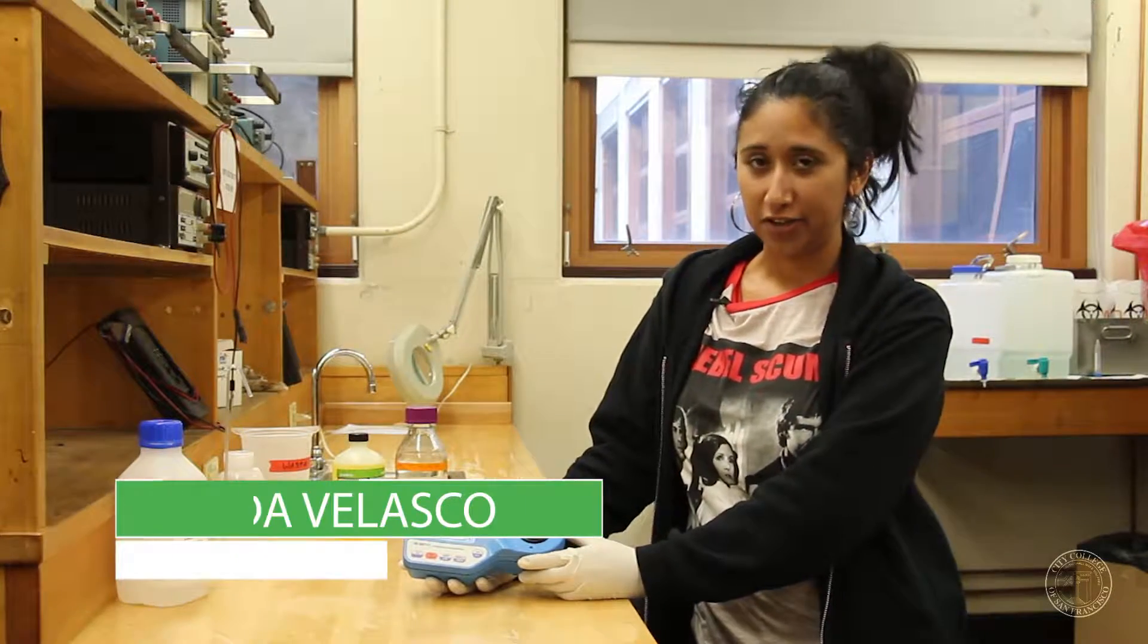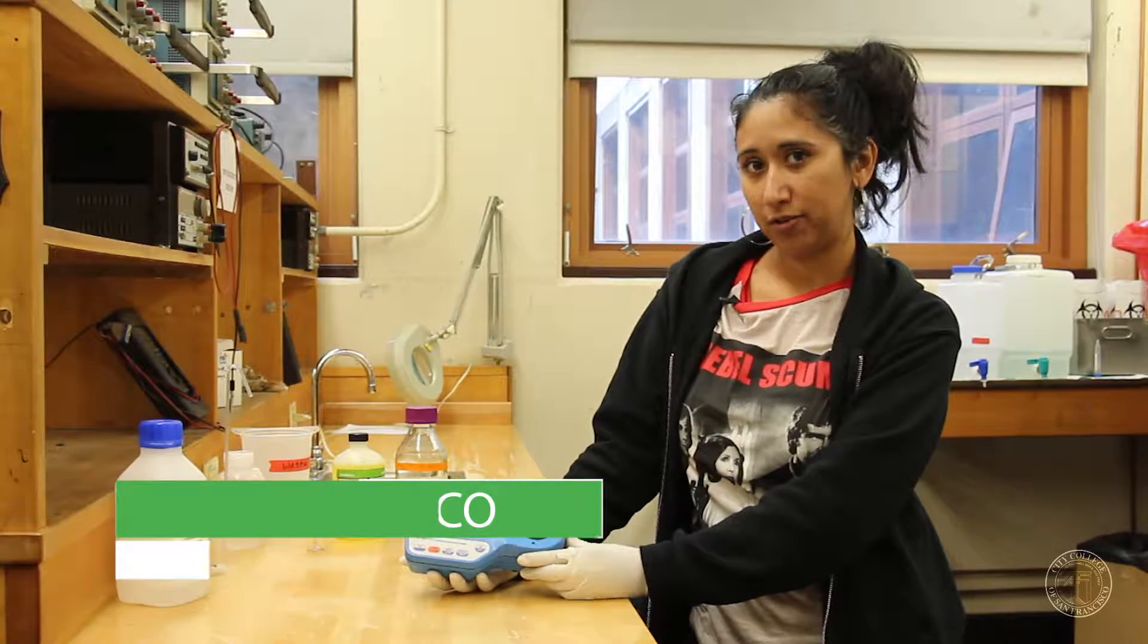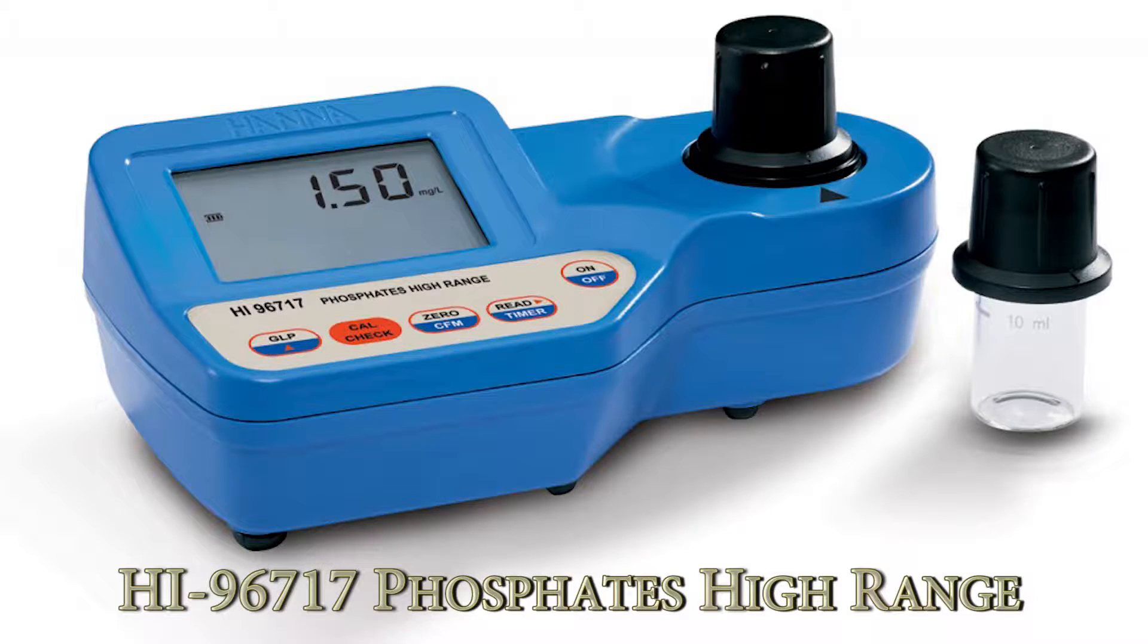Today we're going to show you how to use the HANA instrument. This is our HI-96717, which tests for phosphates in high range from 0 to 30 milligrams per liter.